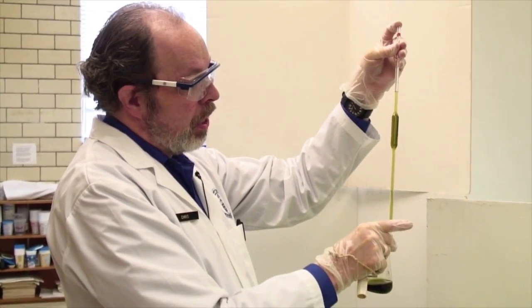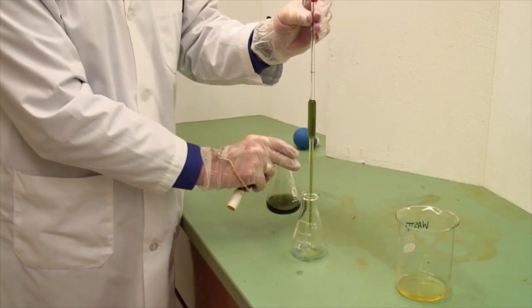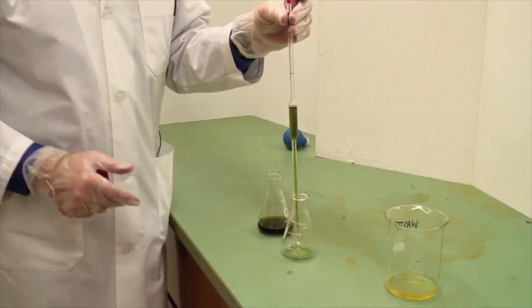If there's a drip on the tip, touch it to the dispensing vessel. Place it over the receiving vessel and allow it to flow out.